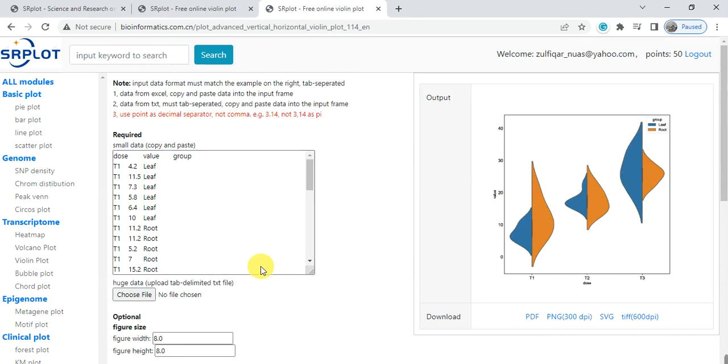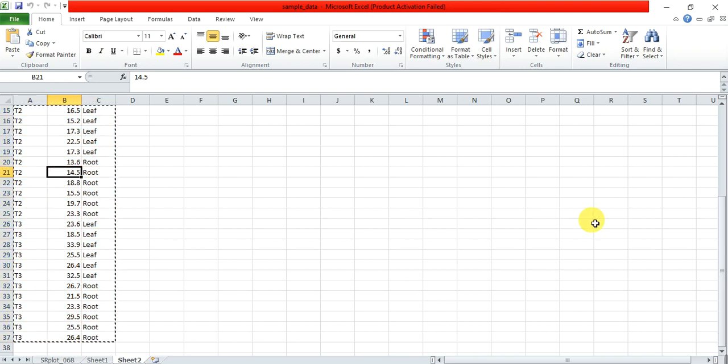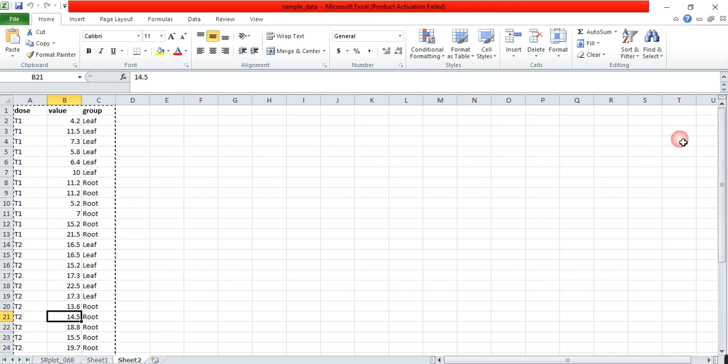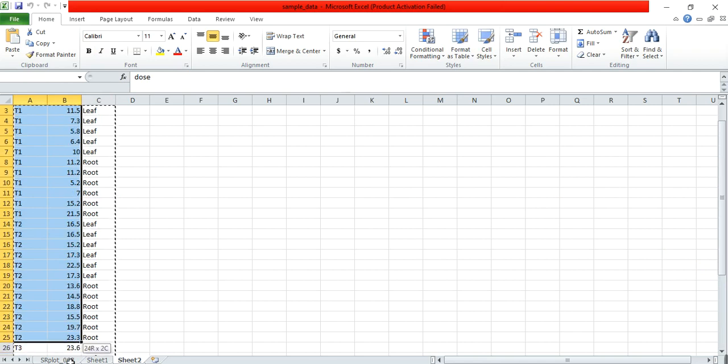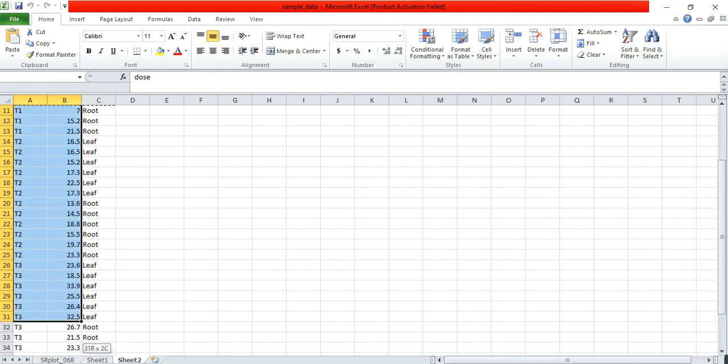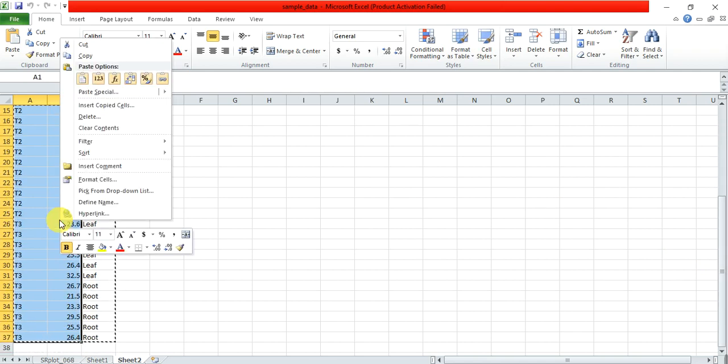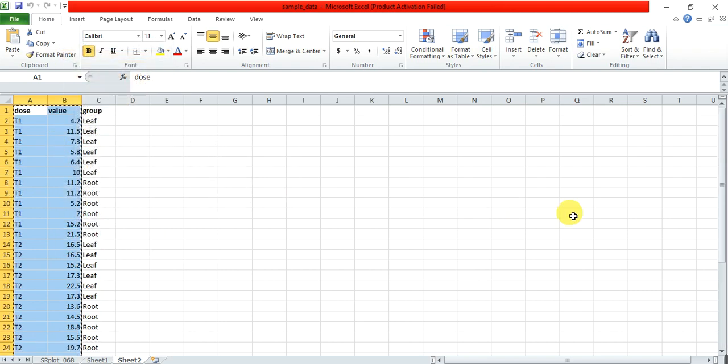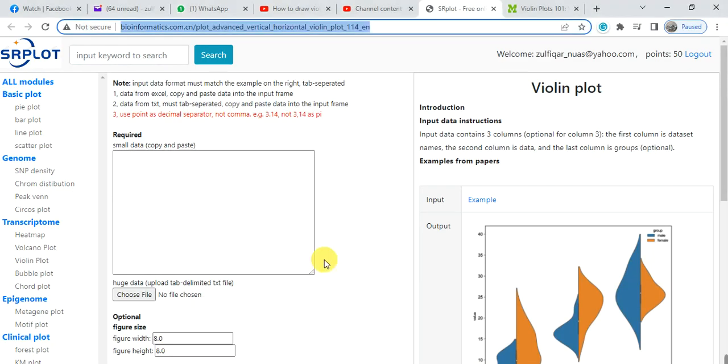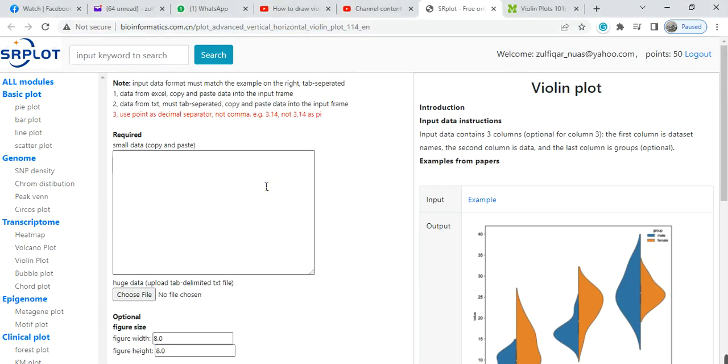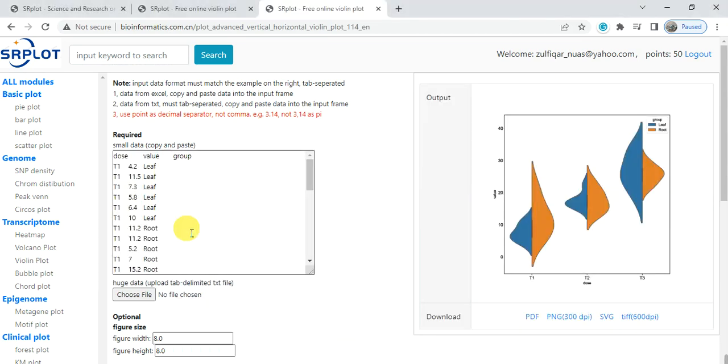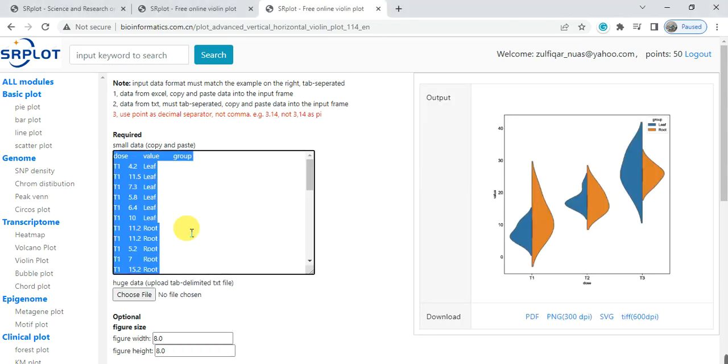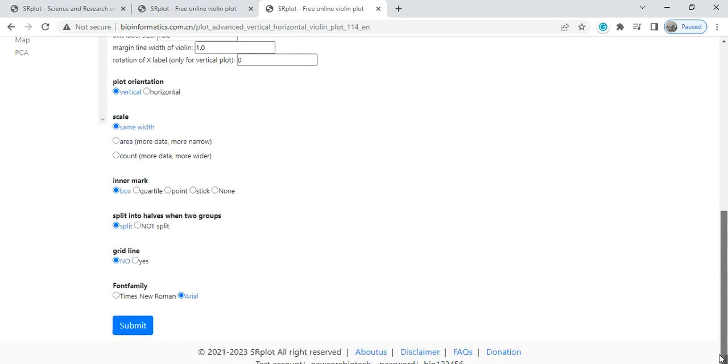And if you didn't have that group, you only can put this data. You didn't want to see in your any organ like this. So, you can also put that treatment and the value data. Then, it didn't distribute it in the groups. Select all and submit.